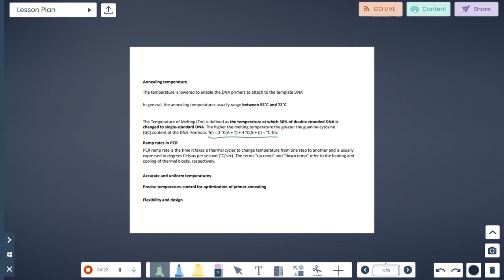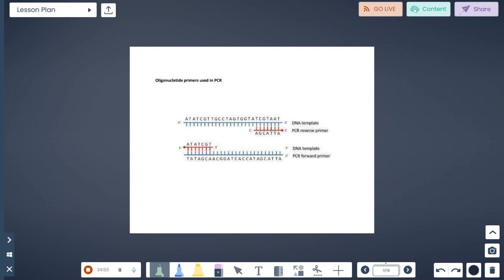If you are using a heated lid, you can use a smaller volume up to 5 microliters. If you add mineral oil, when you try to take the PCR product, it will mix with the mineral oil and you cannot use it for further processes. Even if you load it in an agarose gel, it will come out because of the presence of oil. So a smaller volume PCR can be done if you are using a PCR machine having a heated lid.